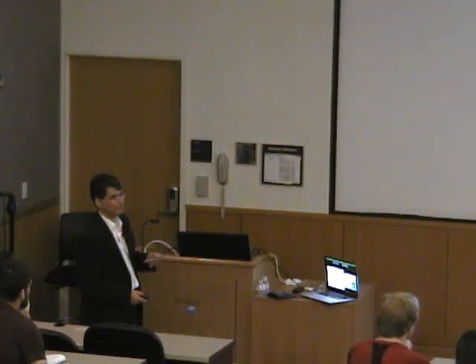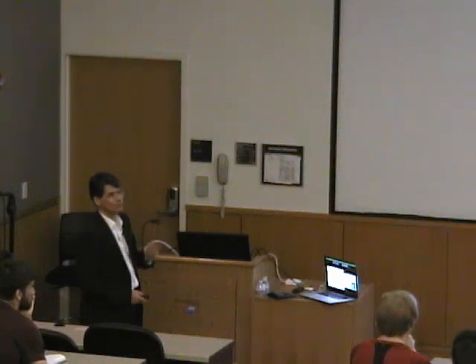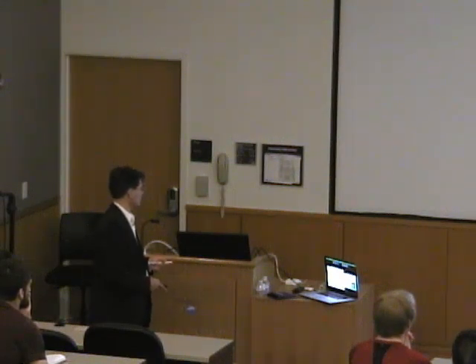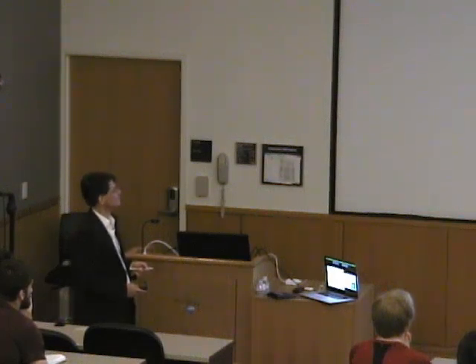And I think Ed and his co-workers have figured out that there are huge classes of iron(II) enzymes that all work according to the same mechanism. And I think MCD has been the prime experimental method to prove these relationships. Good. So these are my motivation slides for why you want to use MCD.